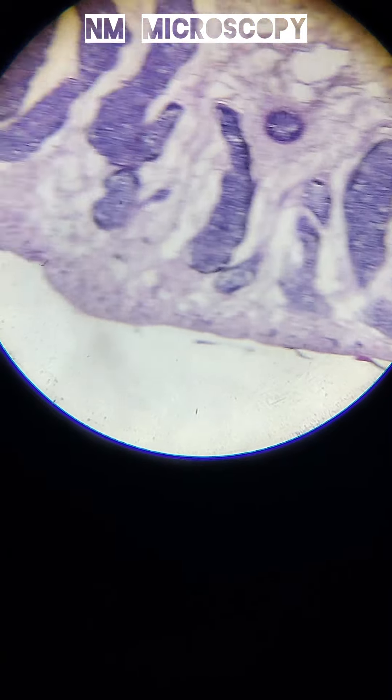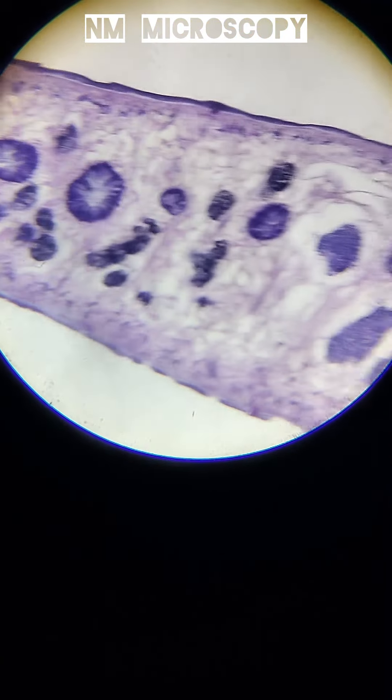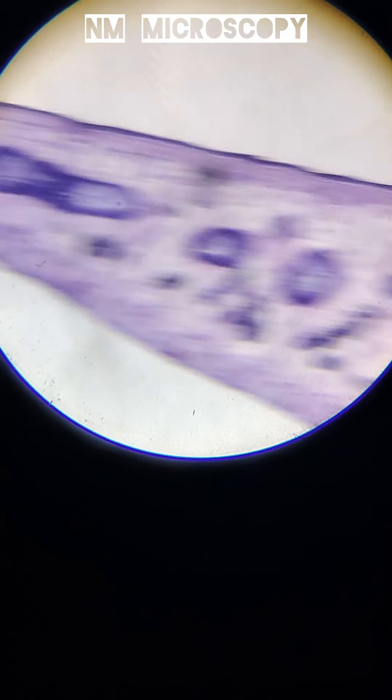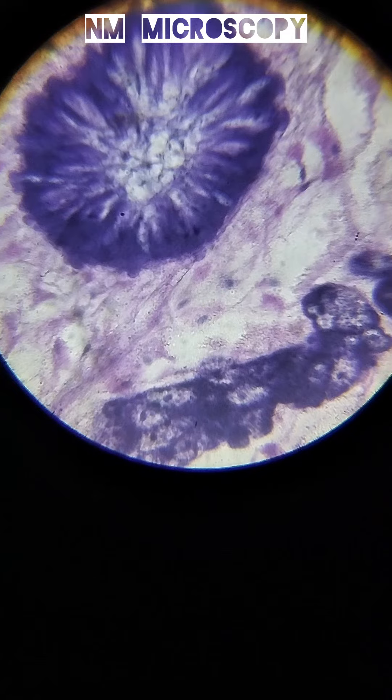When viewed under a microscope, you can see a flattened body with a leaf-like shape, and suckers — one near the mouth, the oral sucker, and another on the underside, the ventral sucker. You can also see the branched digestive system, visible through the body.